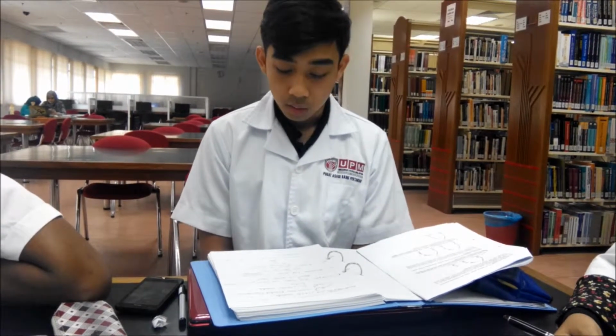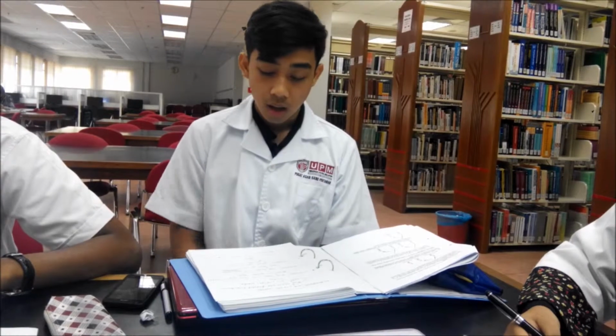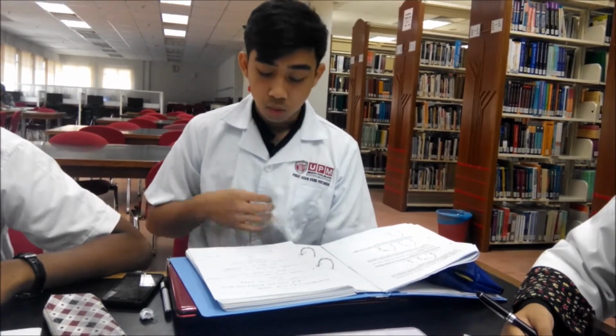After starting the timer, we micropipette 500 microliters of the enzyme reaction, which is the one before, into the cuvette solution according to the times labeled on the cuvette. So after 1 minute, we put it into E1, which is 1 minute, and then 2 minutes, and then 4 minutes, and then 6 minutes.